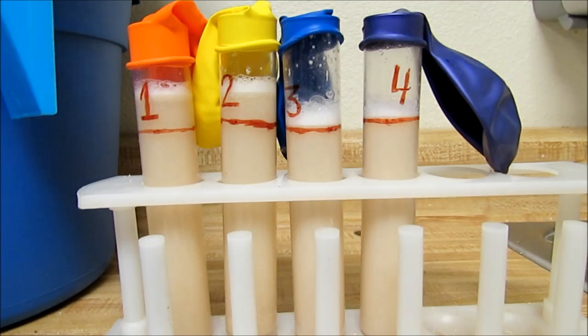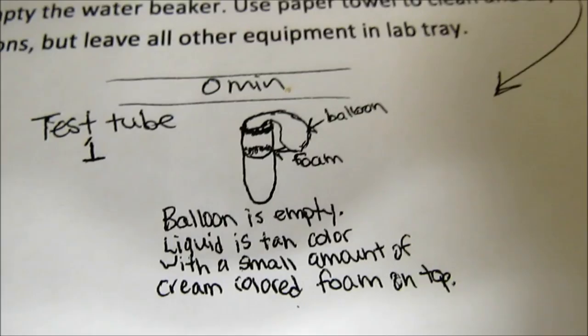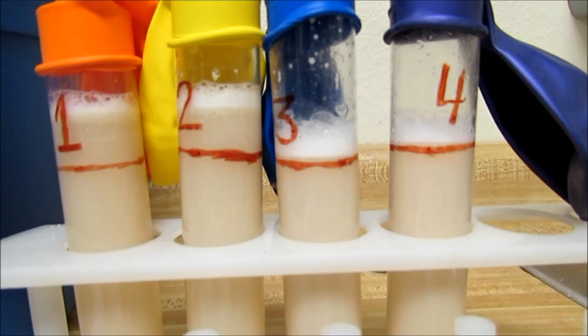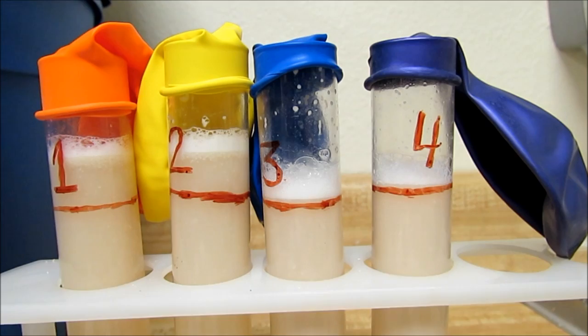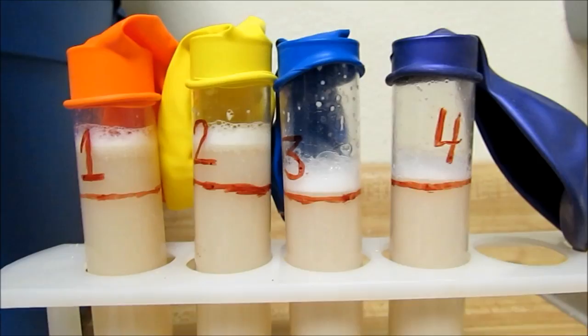So this would be the observation that you're going to want to write down for your zero-minute observation. In your observations, do be sure to include a drawing as well as a description for each test tube. So again, looking closely, there you can see something that you could observe for each test tube.